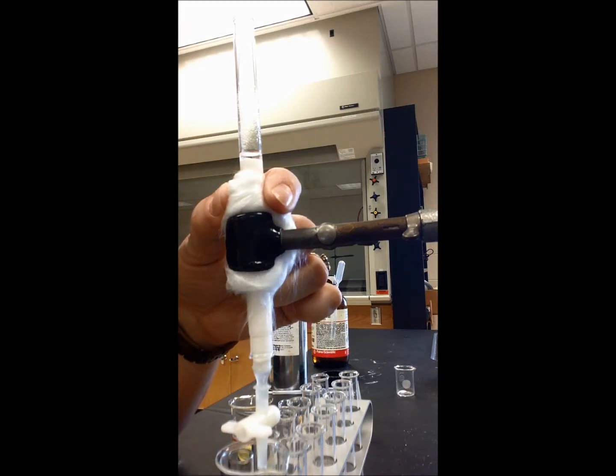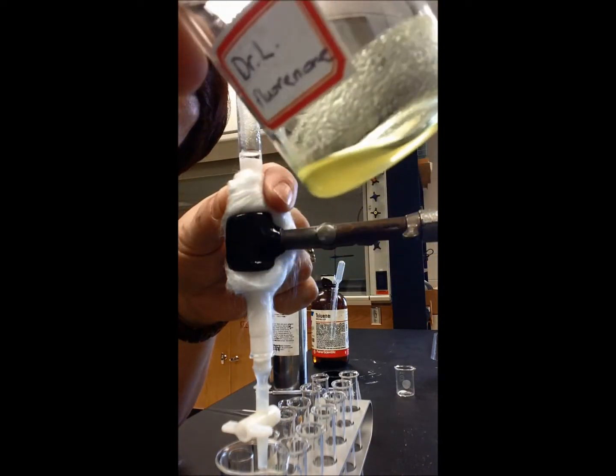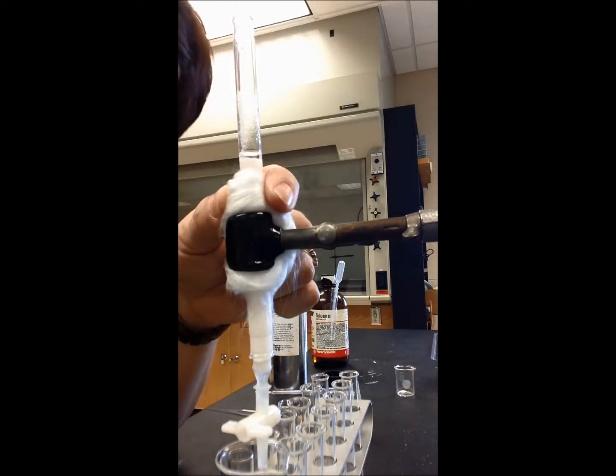Now I'm going to load my sample onto the column. I've got my sample here — I've dissolved it in 10 drops of dichloromethane and 10 drops of toluene, so it's ready to be loaded onto the column.